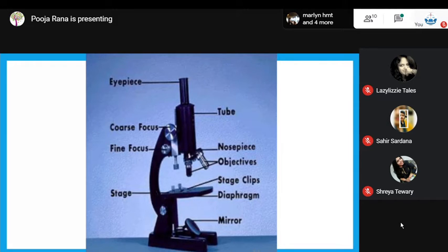So if you get a sample, a soil sample, right? You wish to observe what are the different particles which are present over there. You are not going into a detail of flora and fauna which is present over there. That would be the detailed observation, right? So for that detailed observation, you would be requiring the high power lens. If you wish to observe the soil sample, whether it is containing some blood or not, or whether it is free from some other impurity, you would be using a medium power lens. That would be for normal observation. Then there is this low power lens which is there for scanning the sample. When you are arranging your sample so that you can focus onto any particular specific area of your interest, you would be using a low power lens.